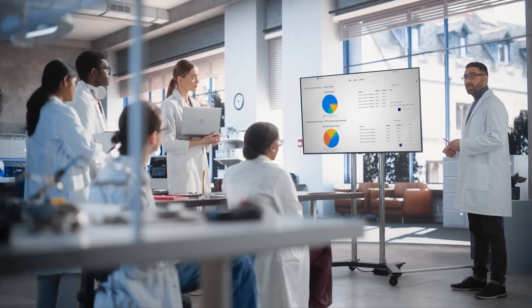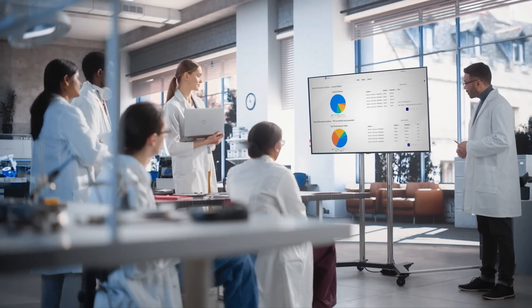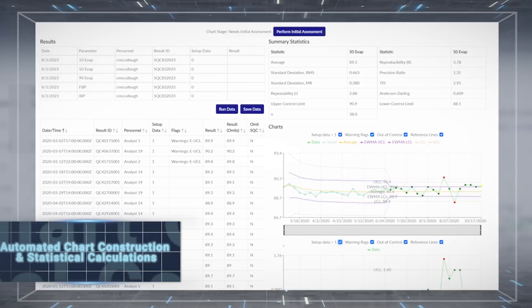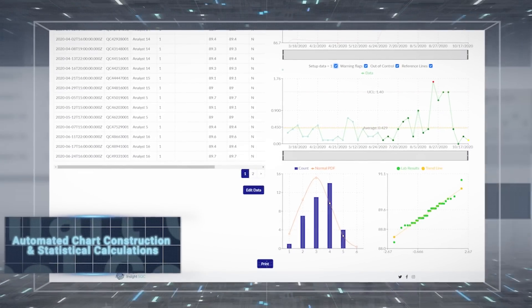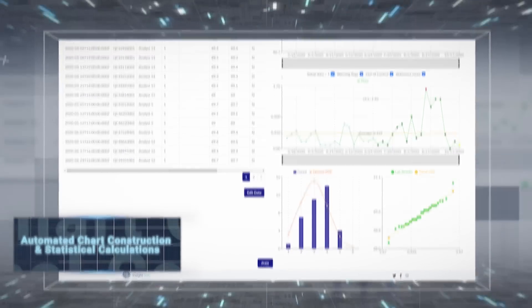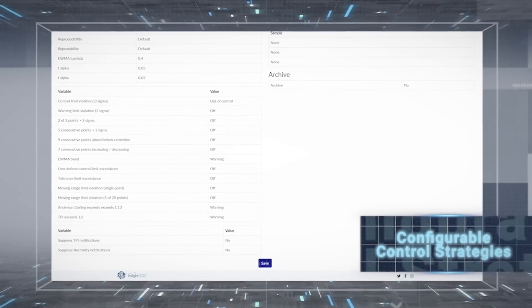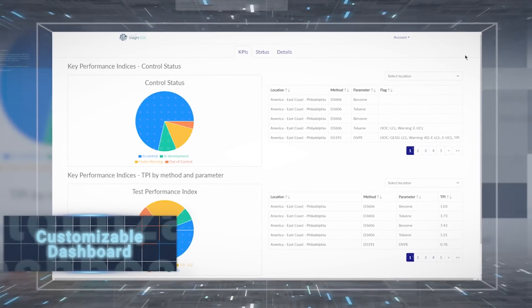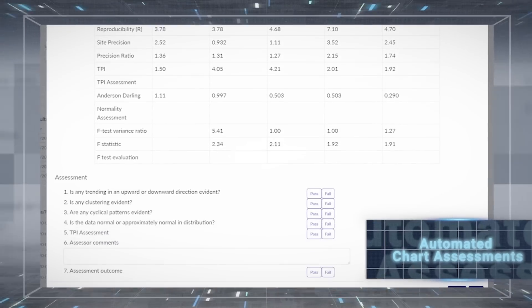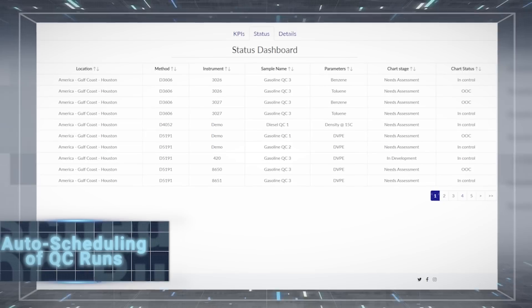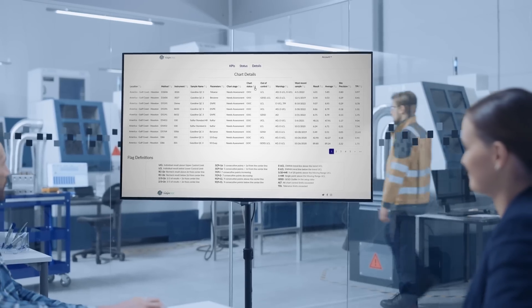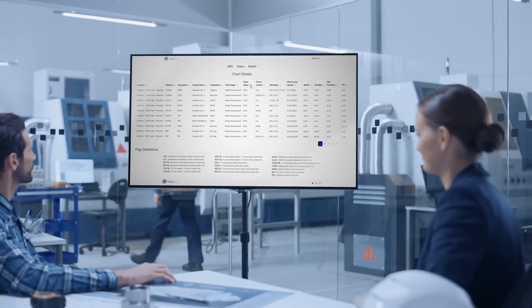Stay organized with all your QC data in one place. Simplify processes and avoid costly errors with standard features like automated chart construction and statistical calculations, configurable control strategies, customizable dashboards for both individual and multiple labs, automated chart assessments, auto-scheduling of QC runs, and sortable resolution tools for use by all your analysts.